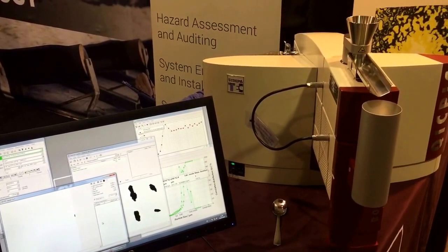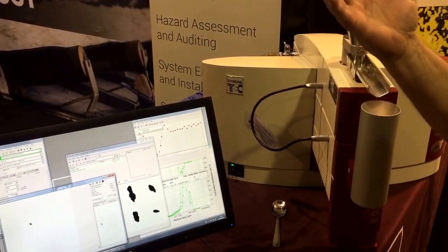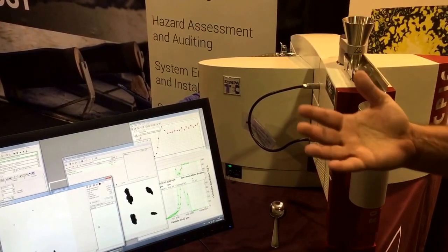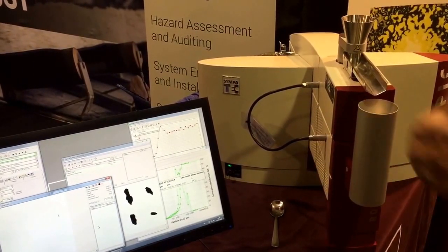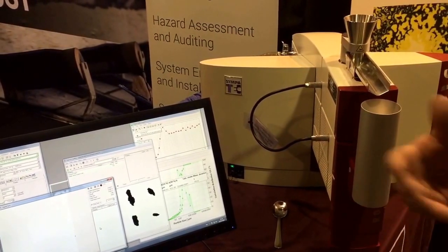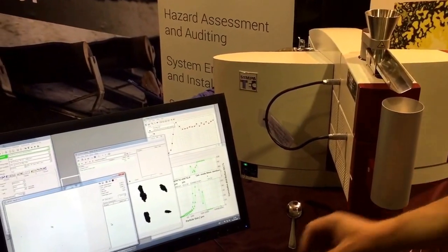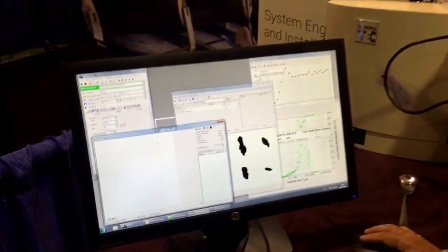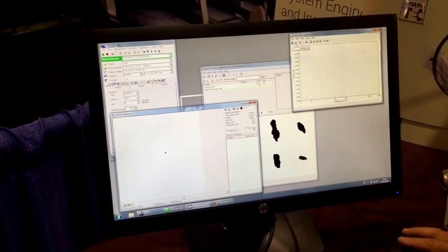Some materials need more pressure, some need less pressure. Metal powder, of course, you're not going to break it, but some stuff that are friable, you have to be gentle with the pressures and whatnot. So anyway, let's go ahead and make a measurement.